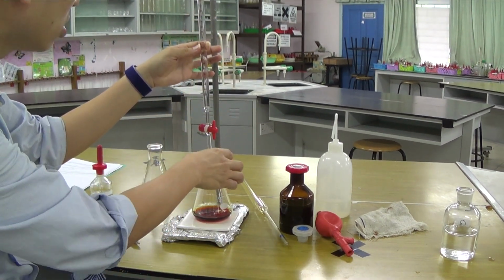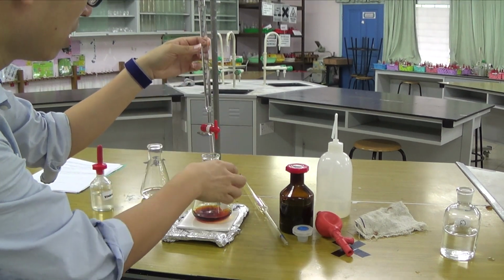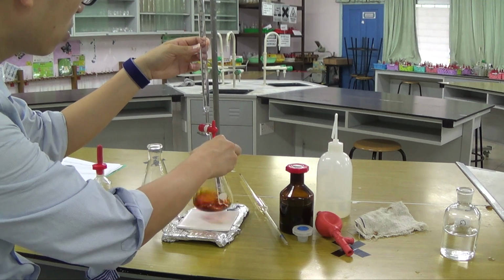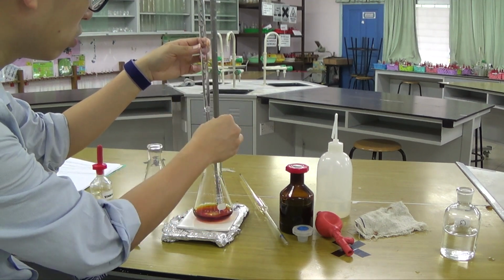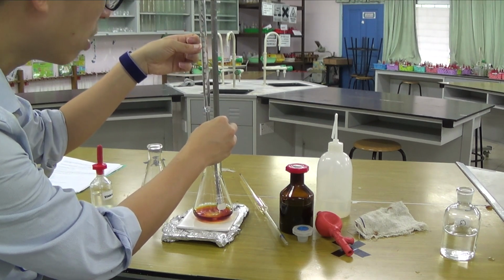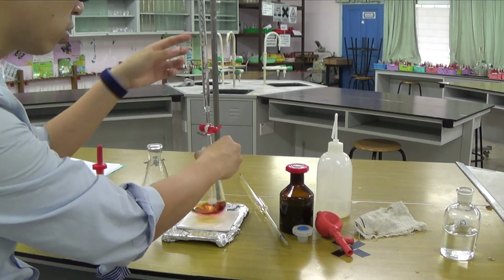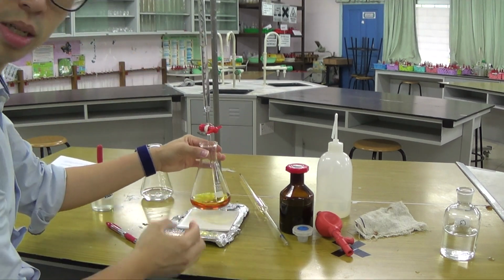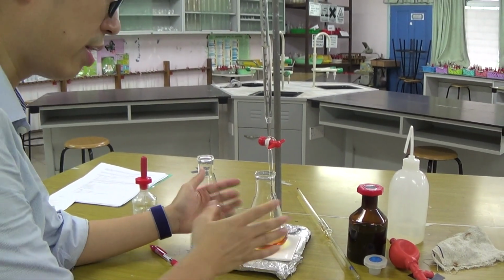And then when it's close to 42.3, the rough endpoint, I'll just keep on adding until it's pretty close, then I'll do it drop by drop. That's the purpose. The purpose of doing a rough titration is so that I know roughly where to stop. As you can see, it is still kind of yellow with brown. So there's still iodine left in there.